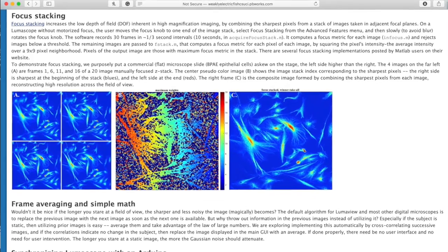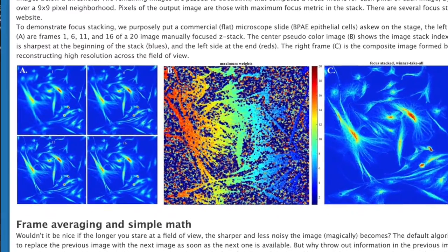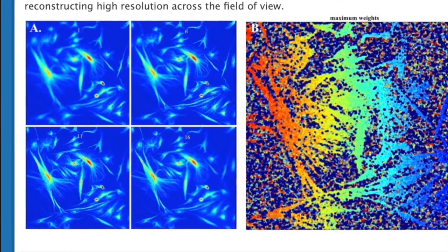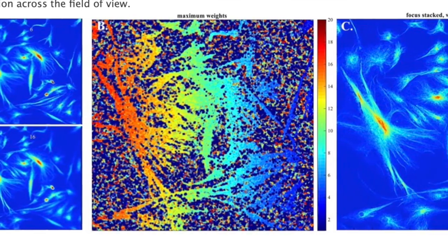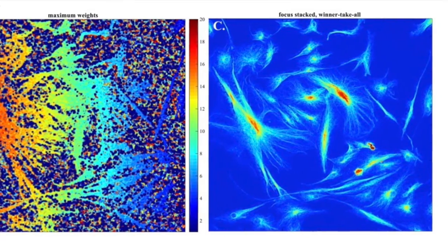We are also able to develop an algorithm for focus stacking of an image. This is important because with large magnifications of a microscope come shallow depths of field that can make focusing on an object very difficult. This allows the user to slowly turn the focus knob, and the resulting image will add in the pixels of the greatest sharpness, giving the user a final image that is sharp all the way through instead of only in a narrow plane.